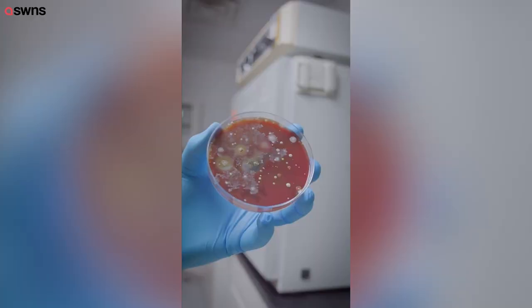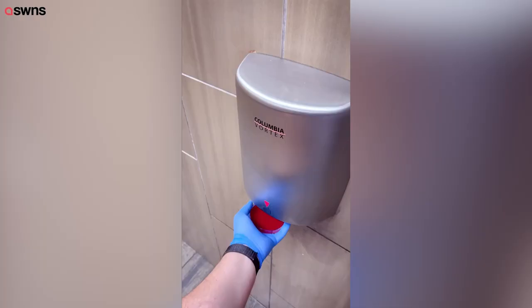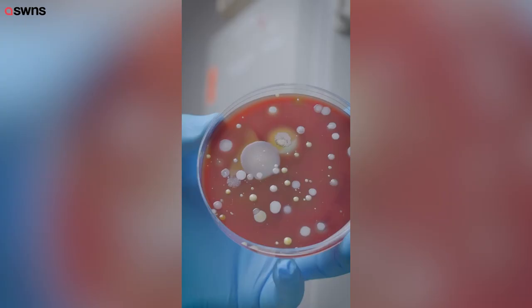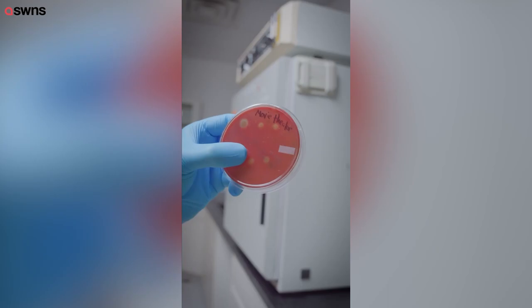There's still quite a bit of nasty stuff coming out of that. This one's at a gas station — still pretty nasty. Here's the hand dryer at a movie theater; not as bad as the last one, but still more than I would like.